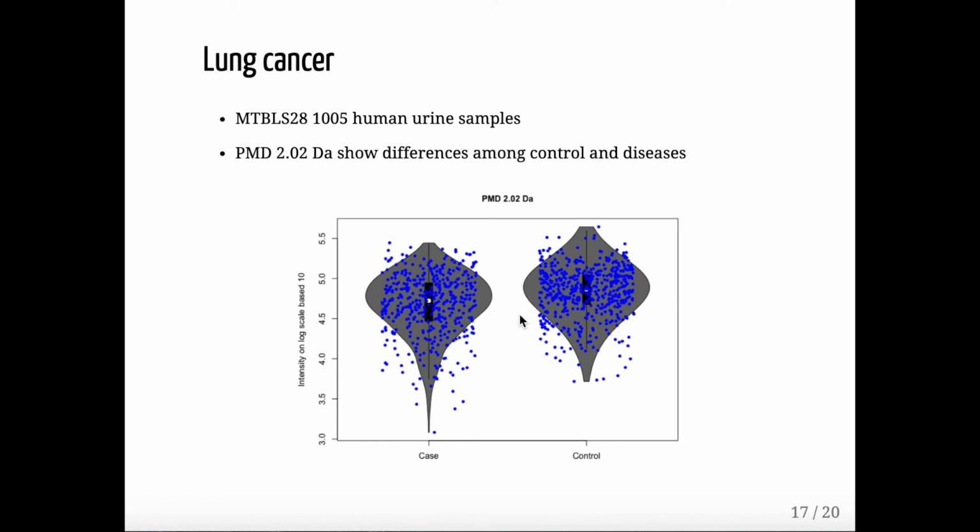So in these cases, I think the biomarker reaction does not rely on one compound. At least it will rely on two compounds. I think if we can get more information from more peaks, the result may be more reliable.